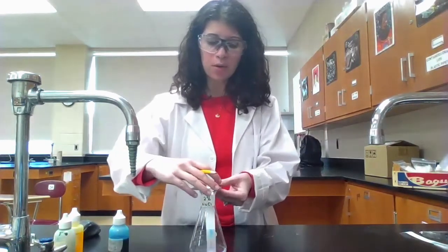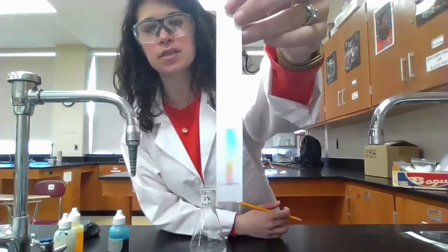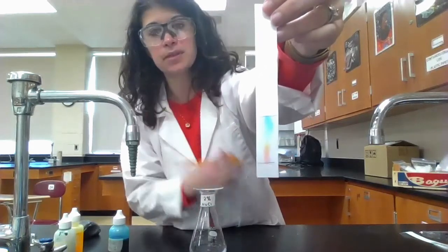Now we can see that there are different components from different dyes in our mixture. I'll take this out, draw a line, and circle where I see the different dyes. Looking at this, it appears we have three different dye components: a blue, a yellow, and a red. In the calculations, we would calculate the RF values for each of the three spots and compare them to the known RF values from our known dyes to identify the components. We'll do that for all five mixtures.